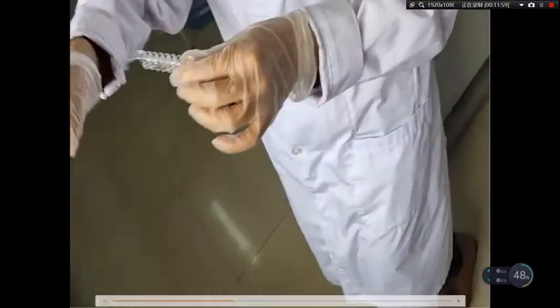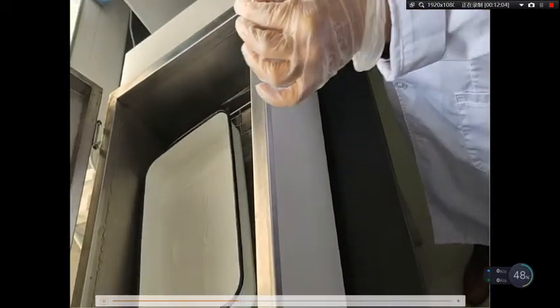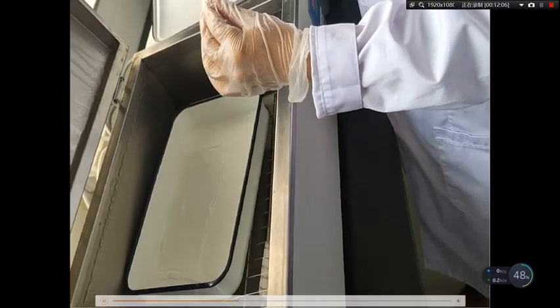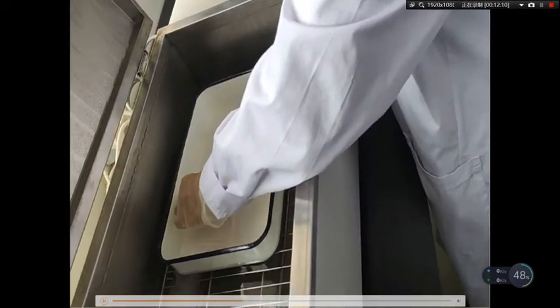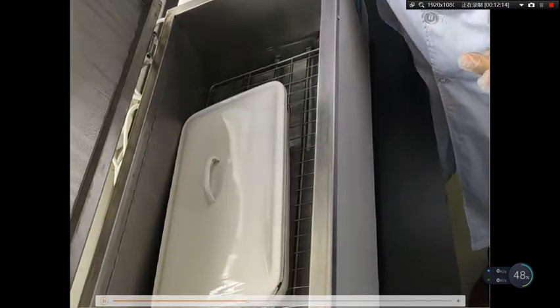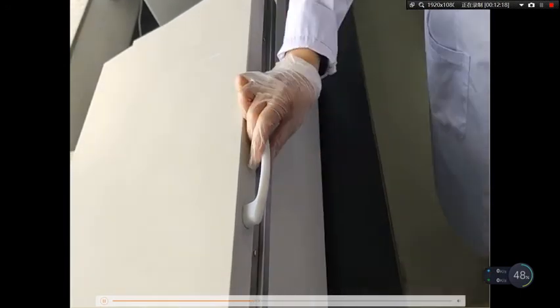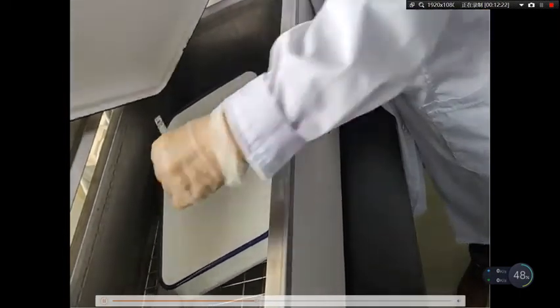Next, we incubate in a water bath for another 30 minutes at 37 degrees Celsius. When the incubation is over, we wash the plate as previously.